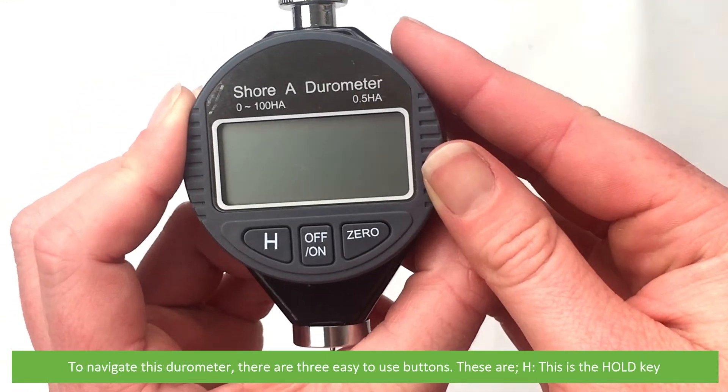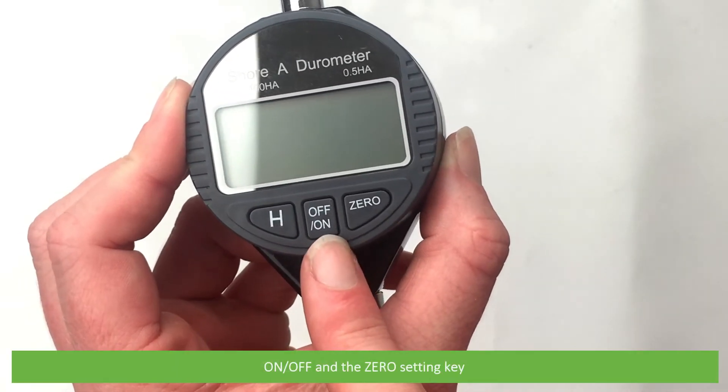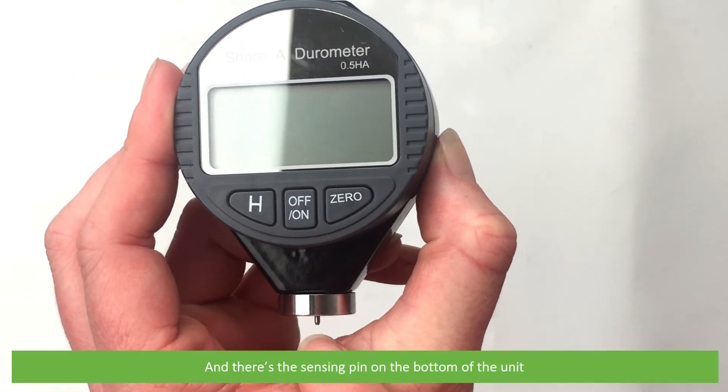To navigate this durometer, there are three easy to use buttons. These are H — the hold key — on/off, and the zero setting key. Then there's the sensing pin on the bottom of the unit.